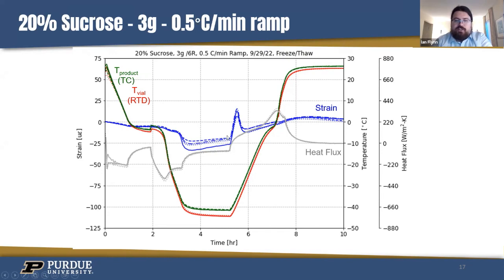There's a little bit of variation during this freezing period, which is probably innate and may come from just different crystal size and how the crystals are growing during the nucleation and freezing period. But we're seeing a peak of very similar magnitude around our glass transition the whole time. And then we end up with some small deviations, but relatively the profile stays the same and the magnitudes are comparable at least.